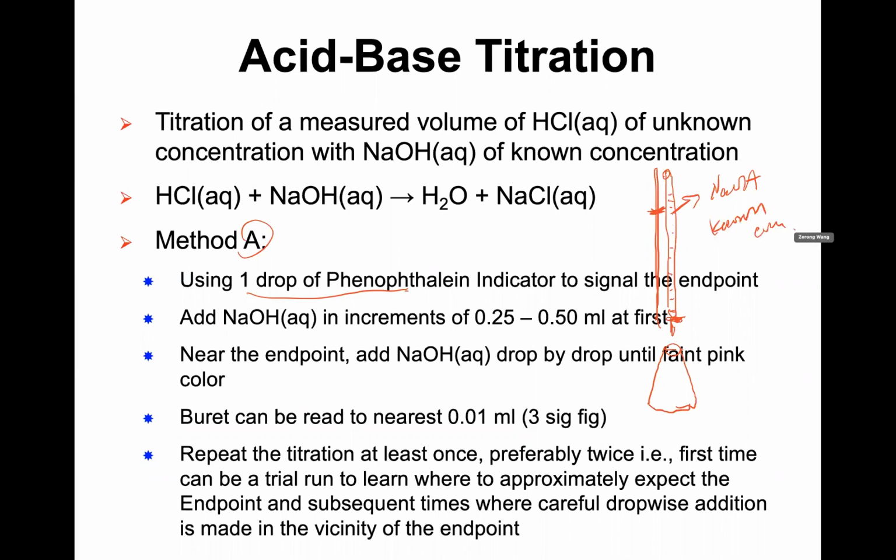And the bottom is hydrochloric acid. We don't know, so HCl, and we don't know the concentration, but the volume, no. How do we know that you are certain how much you transfer to here or how much you measure here? Use the transfer pipette. So you can transfer either 15 or 20, 25. Normally we keep them at 25 because a small amount sometimes is not accurate. So we will use a 25.